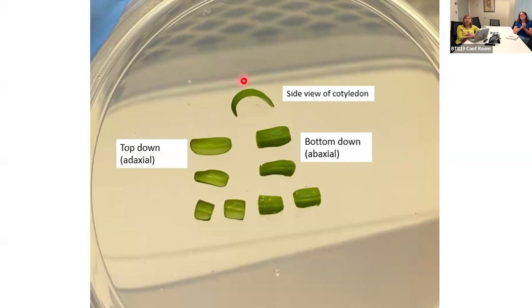So yeah, as Carrie mentioned, this is a side view of a cotyledon. So this is the top side of a cotyledon, and then this is the bottom, what we're calling bottom or underneath. So, okay, sorry, go ahead, Carrie.